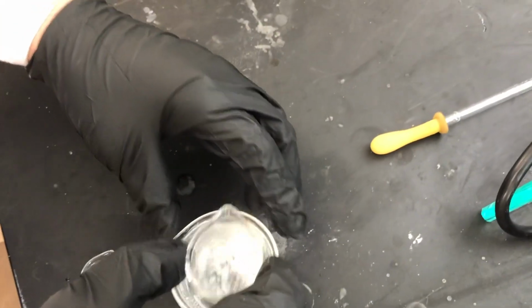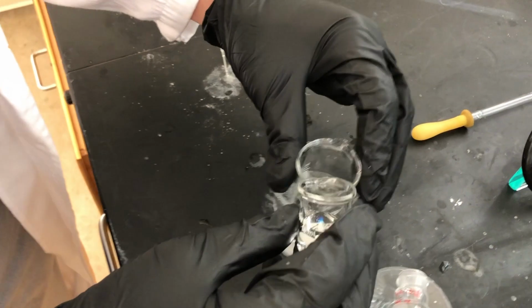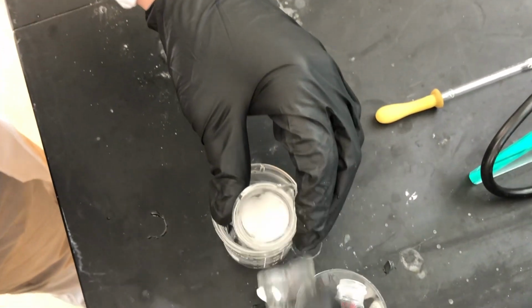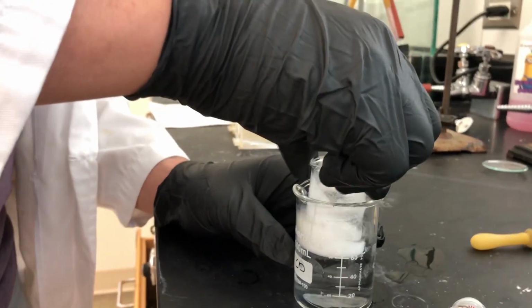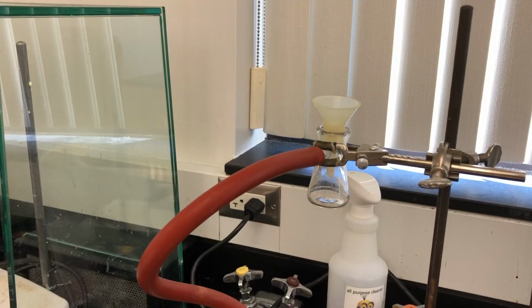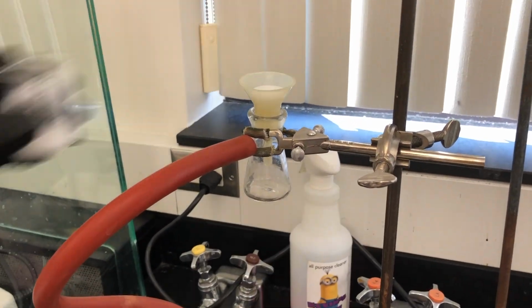I'm going to mix it around. If it dissolves, that means it needs a little bit more HCl. Okay, so we're going to add some more HCl here. And there you go, that's precipitated. And now we're going to run it through the Hirsch funnel. Okay, so we're going to run the white precipitate through the Hirsch funnel.